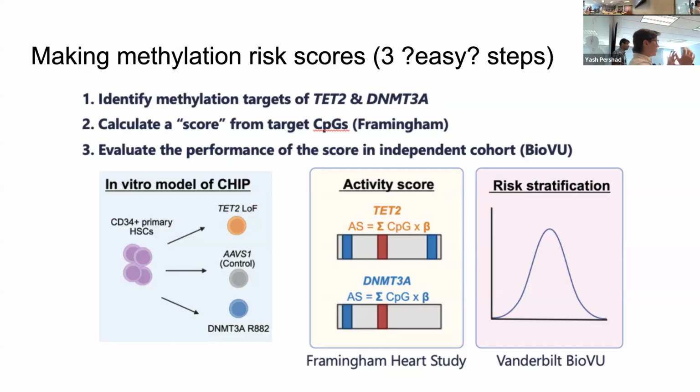So you can take heart disease, and ask, does this set of CpG sites predict heart disease better than this set of CpG sites? We're happy to talk about when and why you might want to do it, but it can be useful for comparing populations. It can be useful for comparing different sets of CpG sites. You can do this by comparing promoters, right? They should probably predict heart disease better than quiescent region methylation. So that's kind of that.